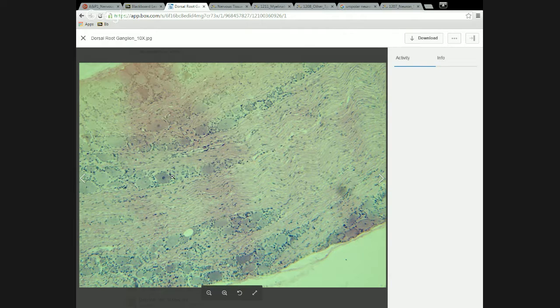Not all of these cells are going to carry information all the way up to the brain directly. Some of them carry information just into the spinal cord right there so that it doesn't continue on any further. And so some of these smaller ones might be like that, and they're usually going to be pain receptor neurons or something like that. So I was describing that really long axon.